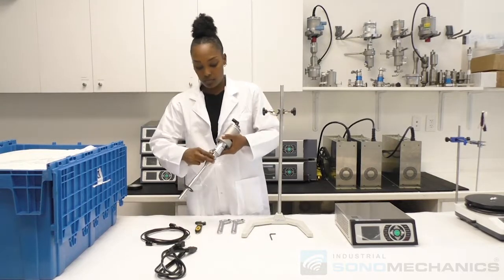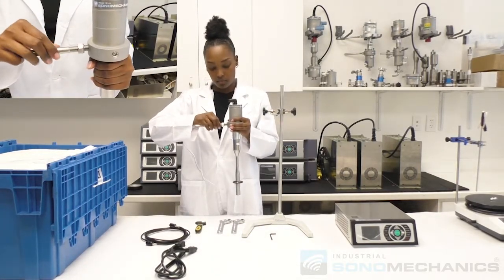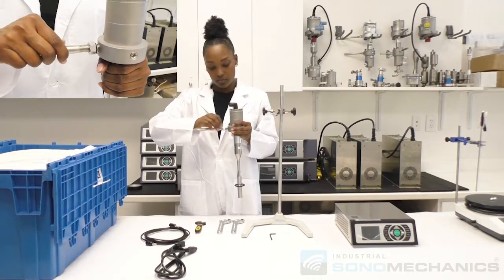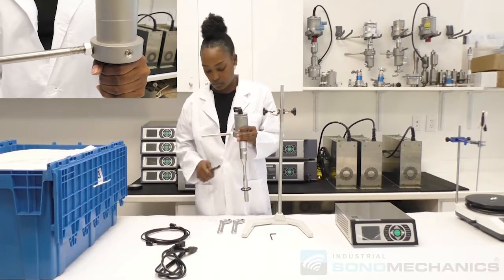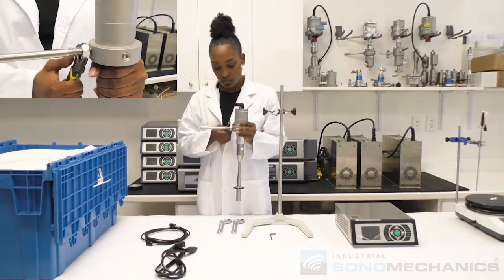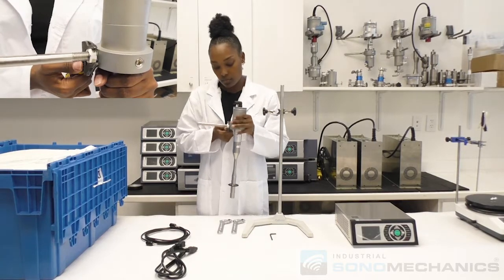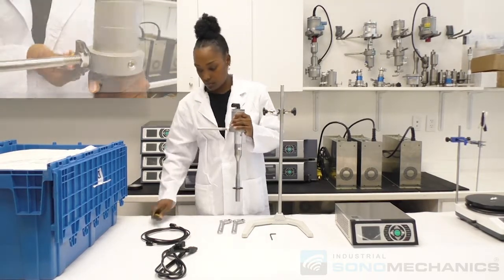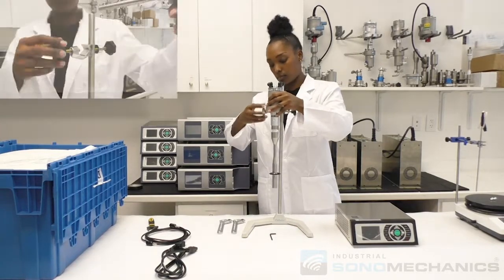Thread the support arm into the transducer and adjust the counter nut by turning it clockwise by hand. Tighten with the adjustable wrench. Secure the ultrasonic stack in the clamp holder on the support stand.